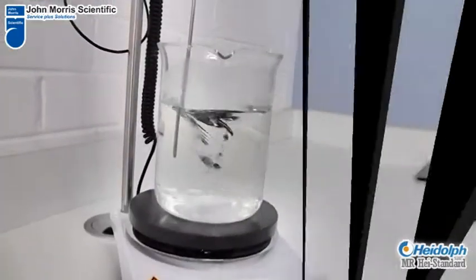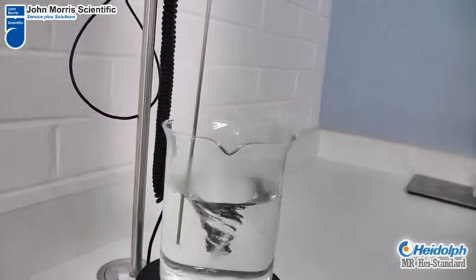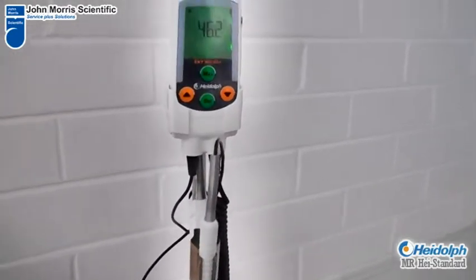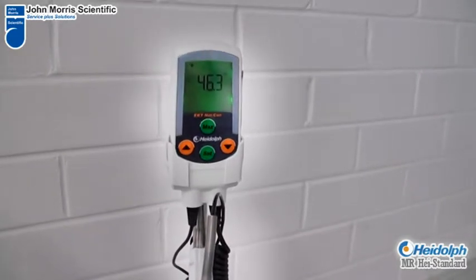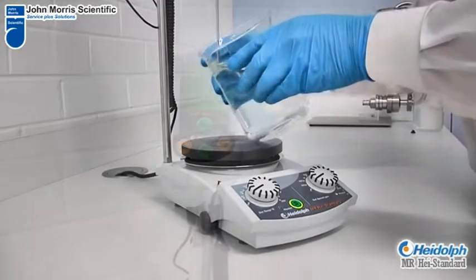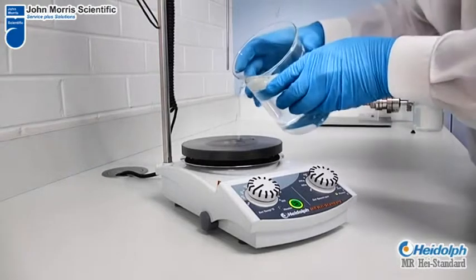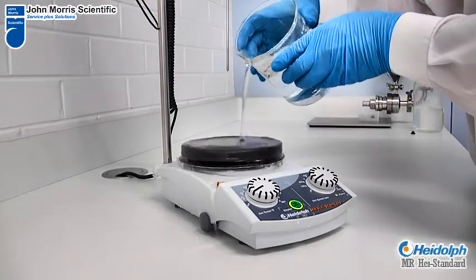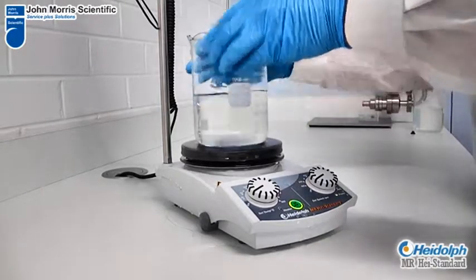The MR hot plate series can be enhanced with an EKT contact thermometer, giving it very tight temperature control. Another feature is the hermetically sealed housing, which prevents the unit against liquids and vapours affecting the motor or circuit boards, extending performance life and safety.